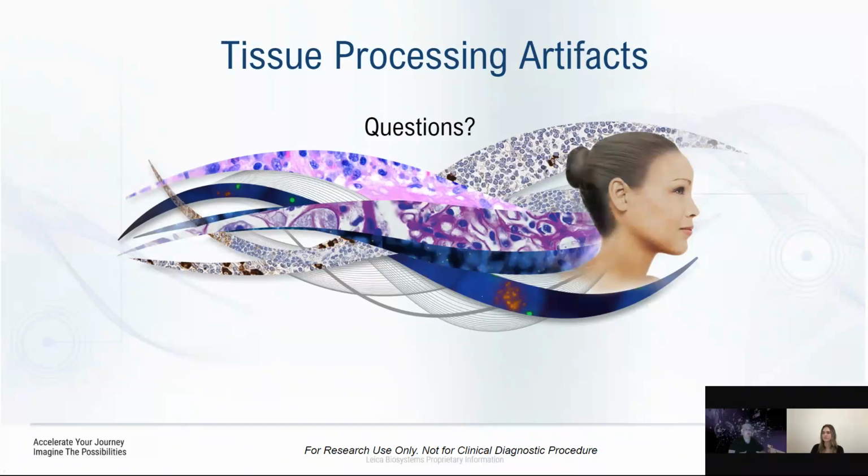Because as we know, not only water, but also heat is the enemy of RNA. RNA is very delicate, tends to break down. So we at Leica have been looking at protocols, and certainly with your application specialists, you can work together to optimize protocols that can pull some of that heat off if you feel like it's going to interrupt or maybe skew the results on the ISH testing that you're doing in your laboratory.